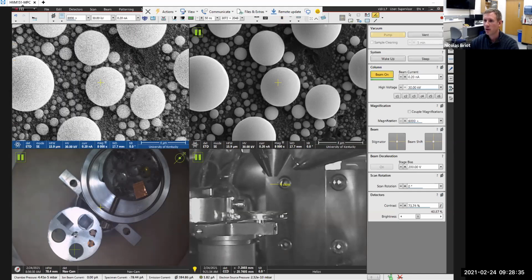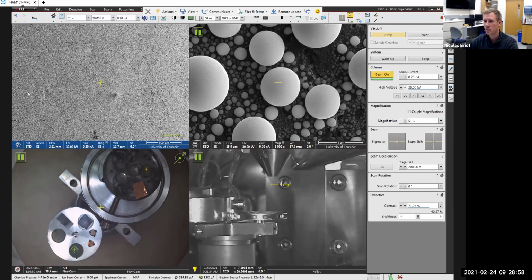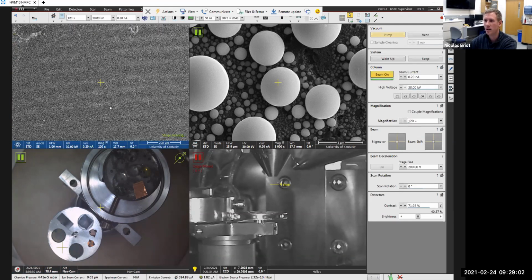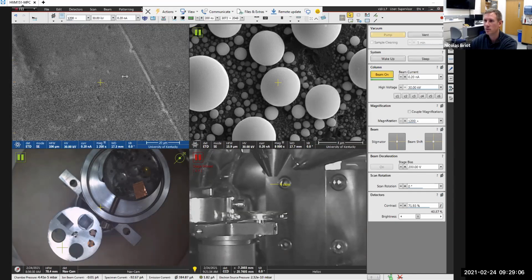All right. One thing I haven't talked about is conductivity. So of course, we are shooting electrons to a sample, so in electron microscopy, we want the sample to be electrically conductive. So right now, this is tin, right? If I zoom out and I go, like right here, that's the holder, that's aluminum, okay? So no problem, I don't see a lot of issues.